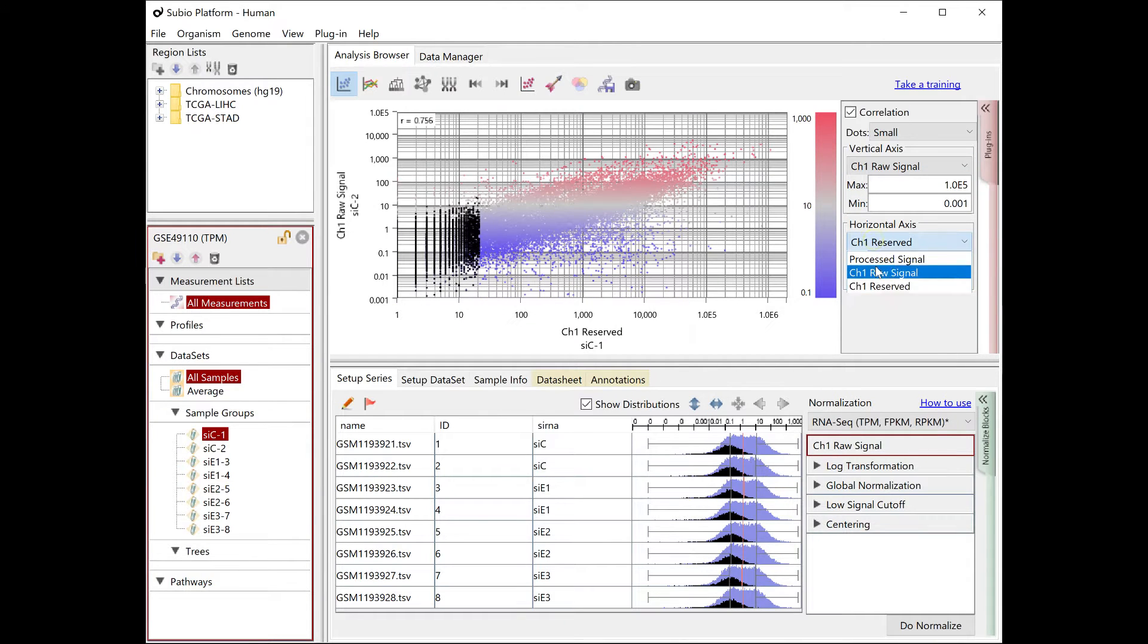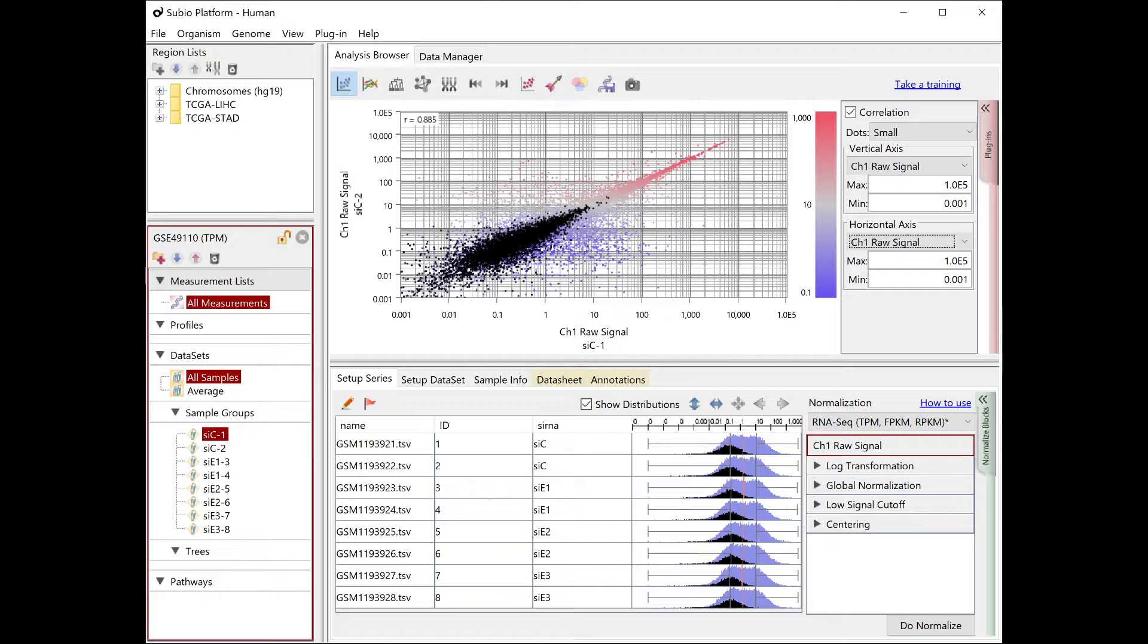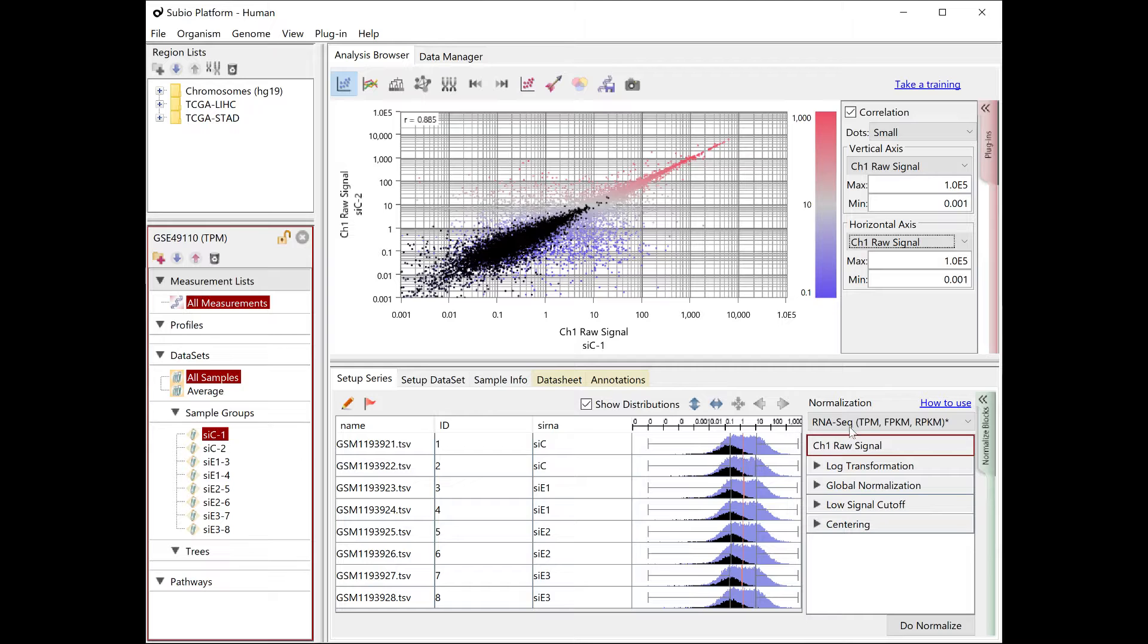Notice that the genes of noise are spread diagonally in the TPM, FPKM, RPKM data.